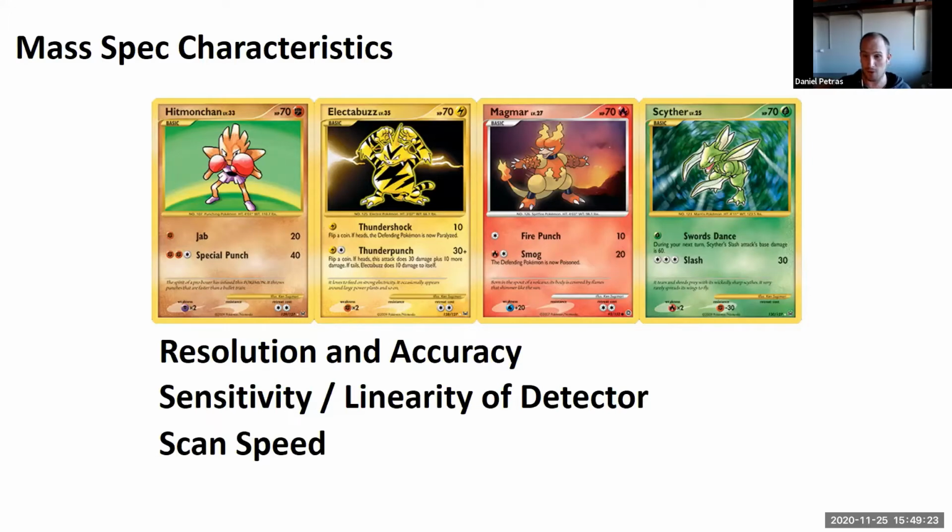This becomes especially important when we're talking about non-targeted analysis, and we actually want to identify as many molecules as possible. Here, I think it's really exciting because we're in a time now where those machines get really fast, and we can actually acquire thousands of spectra in a single LCMS run. All right, and then ultimately the cost, I guess that's especially interesting for the PI level of the discussion, once it gets down to actually buying such a machine. But yeah, here a single quad would be way cheaper than an Orbitrap, for example.